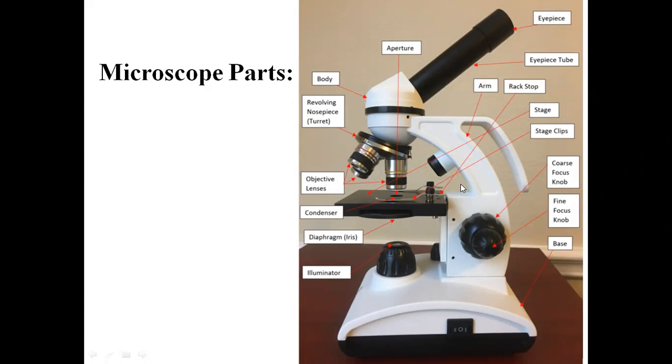In that case, this fine knob will help you to bring the sample into very clear focus. Once you rotate this knob slowly, the sample you have kept here will be much clearer, so a very good image will be formed. This is the function of your knobs.